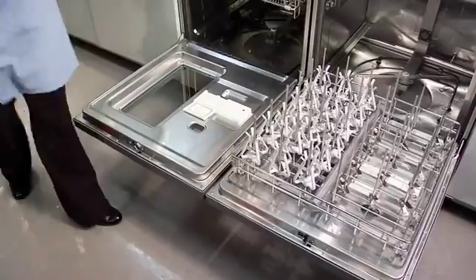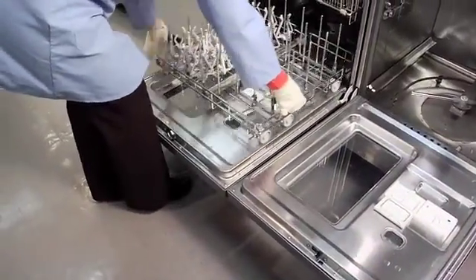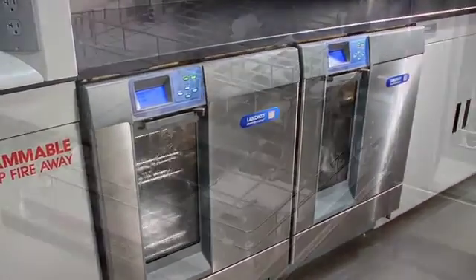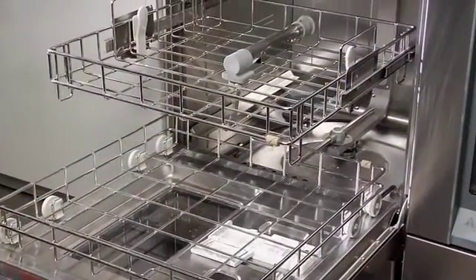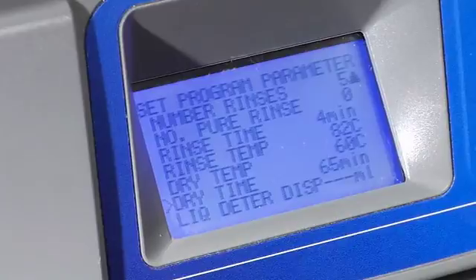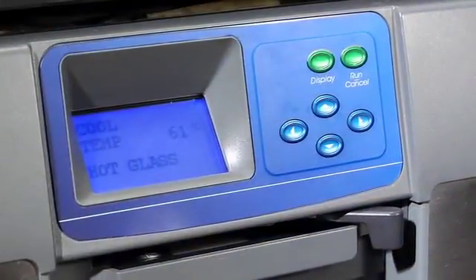Racks are interchangeable from spindle to standard in all three units. Some of the standard features of the Steam Scrubber, Flask Scrubber, and Vantage include stainless steel construction inside and out for durability. An LCD keypad lets you easily customize cycles, monitor water temperature, and cycle progress.